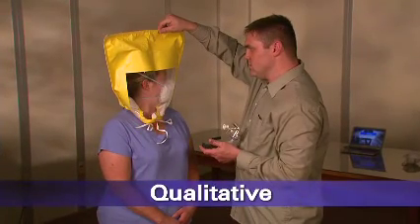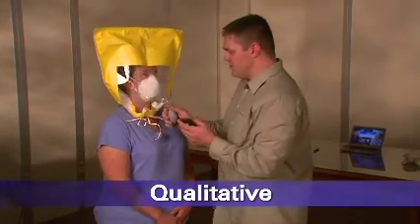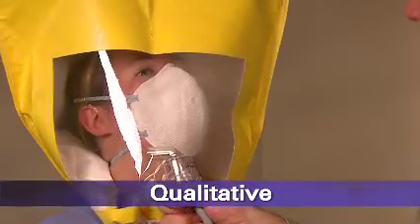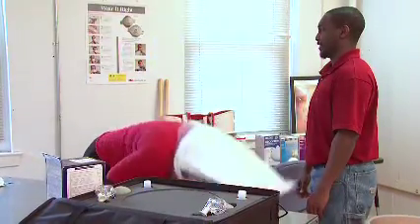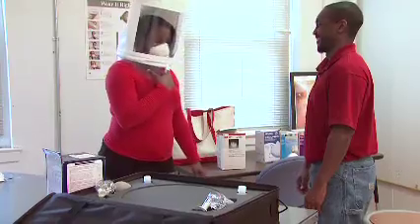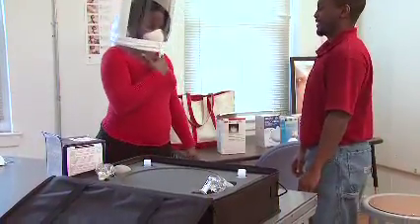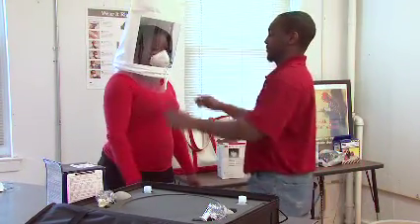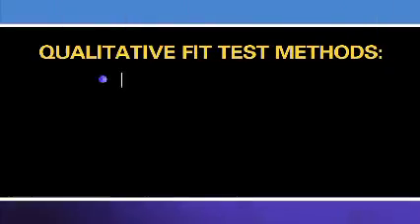Qualitative fit testing is a pass-fail test method that uses your sense of taste or smell or your reaction to an irritant in order to detect leakage into the respirator facepiece. Qualitative fit testing does not measure the actual amount of leakage. Whether the respirator passes or fails the test is based simply on you detecting leakage of the test substance into your facepiece. There are 4 qualitative fit test methods accepted by OSHA.